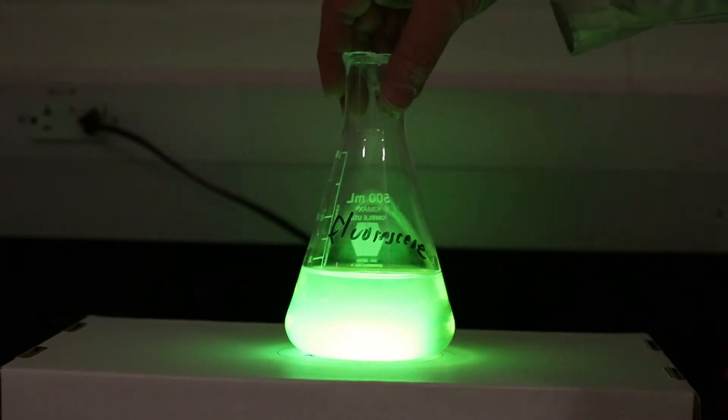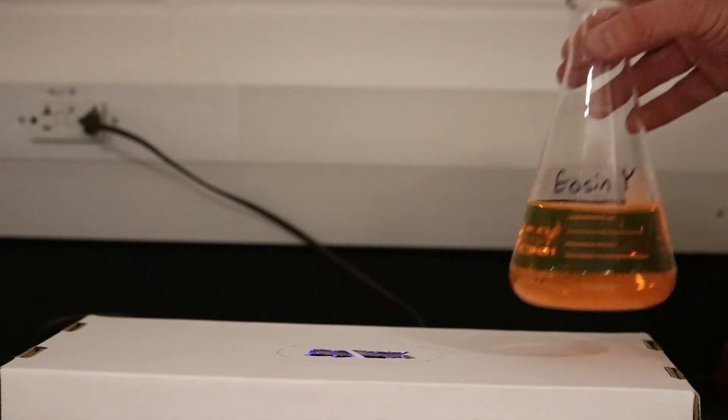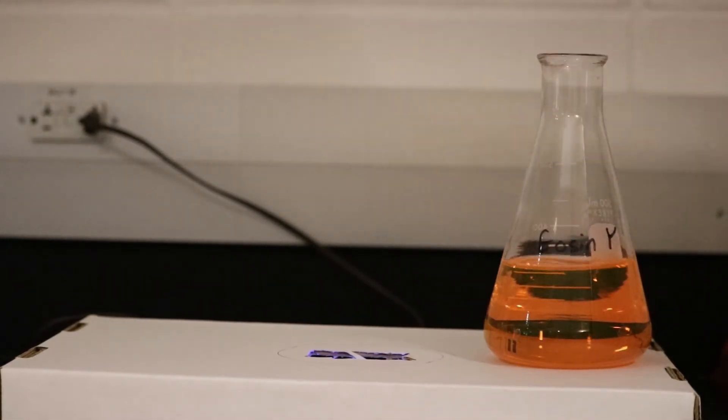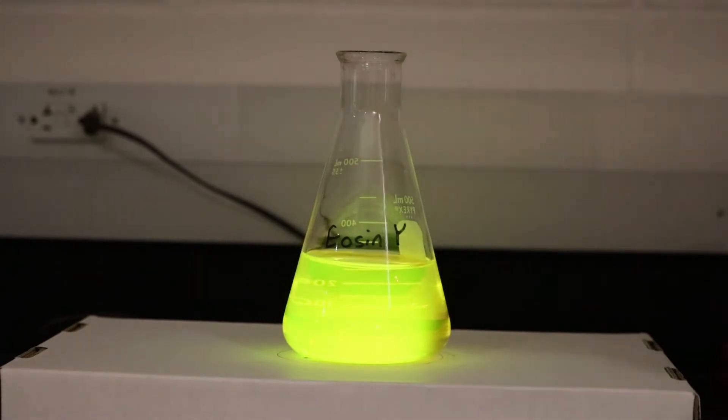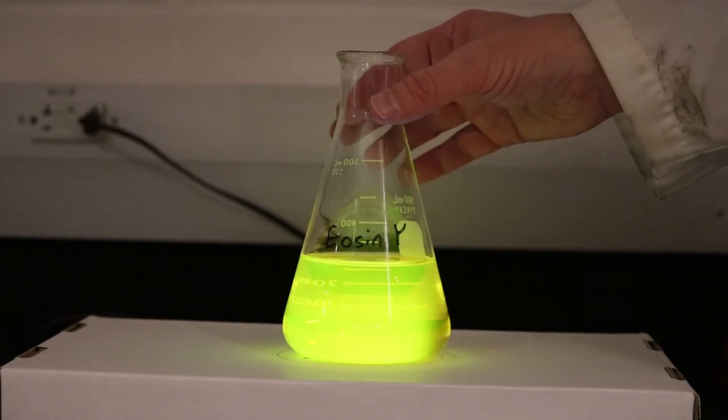I've got a few more to show you as well. Here's one that I like, this is Eosin Y. Eosin Y is sort of a peach color, and if we expose it to ultraviolet light it completely changes color, so we get this sort of a yellowish to yellowish green color that's emitted.